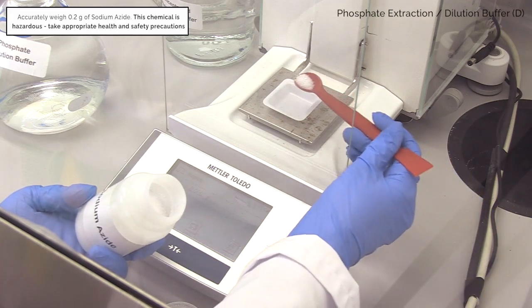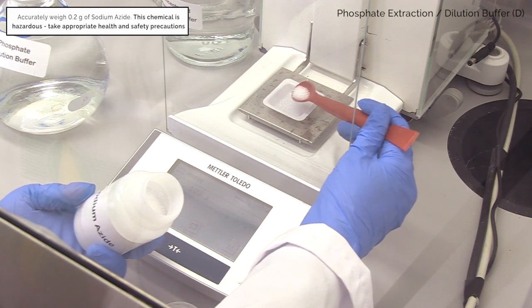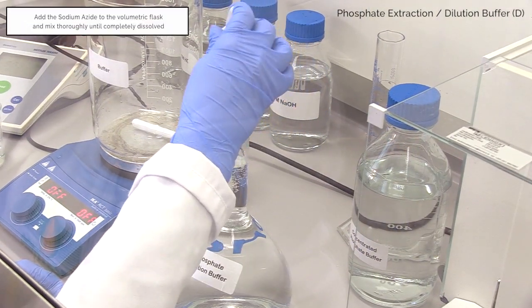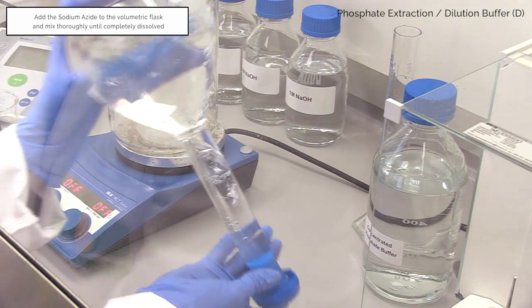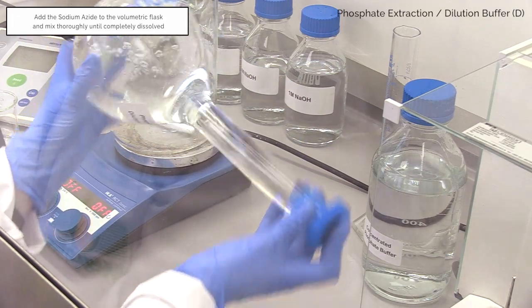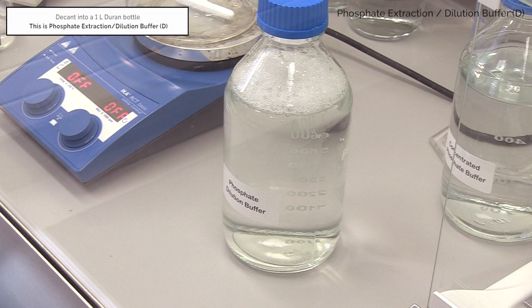Weigh out 0.2 grams of sodium azide and add to the volumetric flask. Invert to dissolve. Decant into a 1 litre Duran bottle. This is phosphate extraction or dilution buffer D.